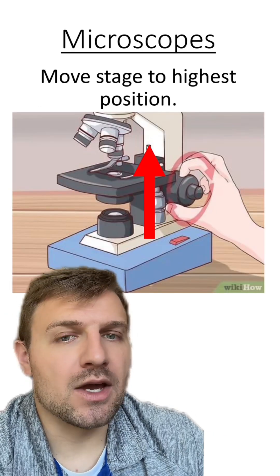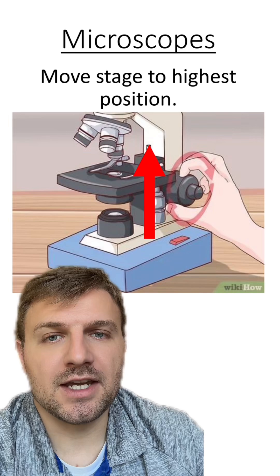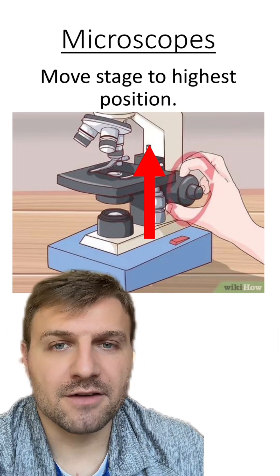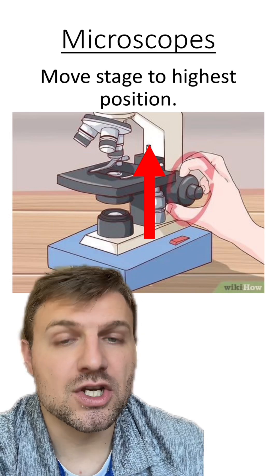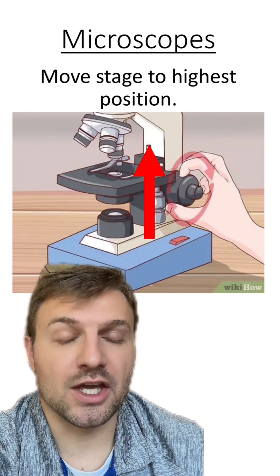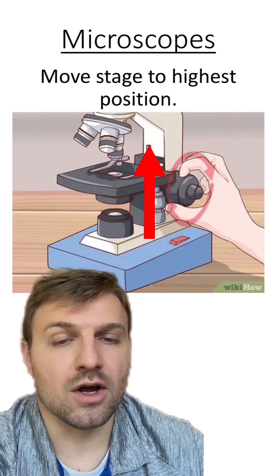Now, when focusing your microscope, I always remind my students to move the stage to the highest position. This helps with magnifying or focusing the image on your microscope. It will just give us a good starting point to focus in on what we're looking at.